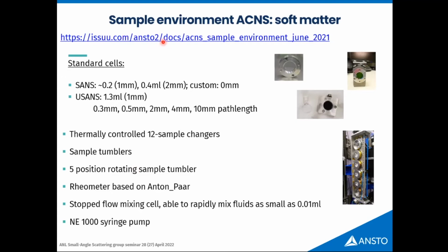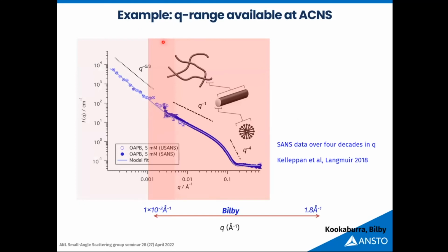And just to give you a couple of nice pictures to show what we can do. And also actually to highlight one thing: I kept saying we have several instruments, and quite often we have proposals merging both. So this one is from Kookaburra and Bilby. That was the surfactants, which have some hierarchy in the structure.